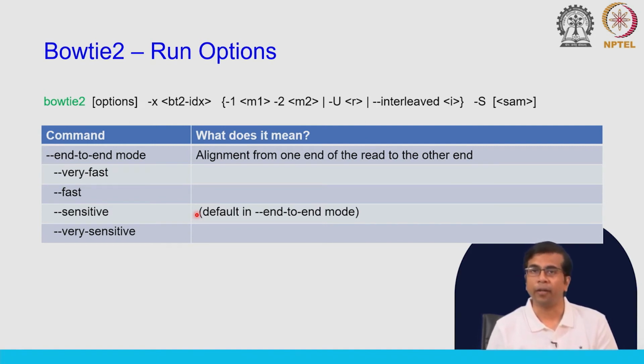Unless you run this multiple times, you will not get the best results. You have to exhaustively search all the alignments, and only then might you end up with the best result. But this exhaustive searching or mapping is very time consuming, so you often ignore that. So, there might be some inaccuracy. Bowtie2 may not always find the best match in case you have reads with mismatches.